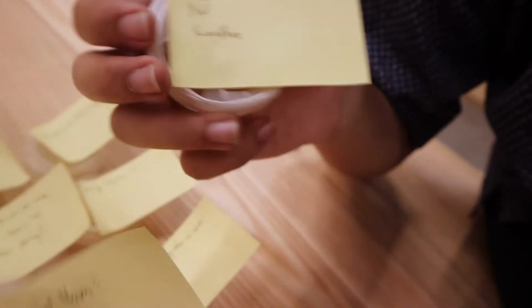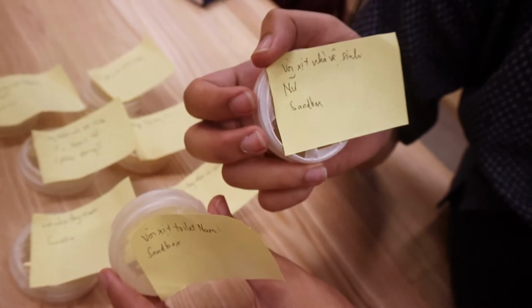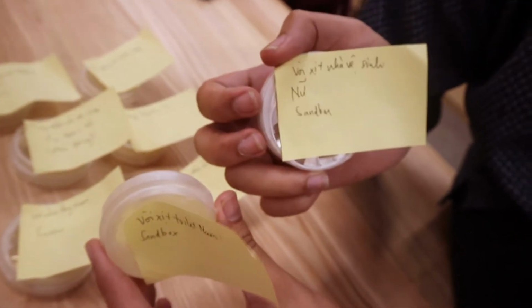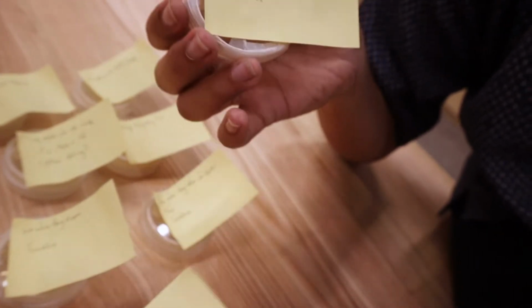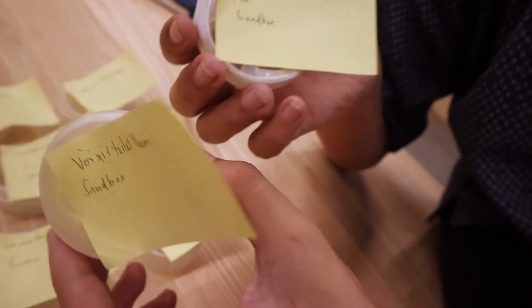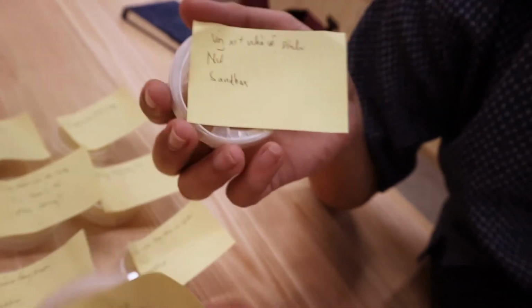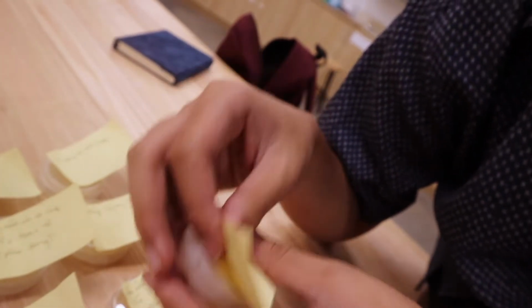Okay? We come to the last pair, the one that we fear the most, the bum guns. So this is collected from the bum gun in the girls' bathroom. This is from the boys' bathroom. Oh, for those white people who don't know what the bum gun is, it's the thing that you use to wash your ass after shit. Okay, let's see.